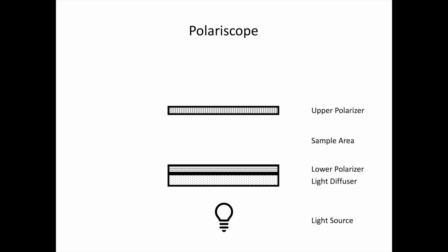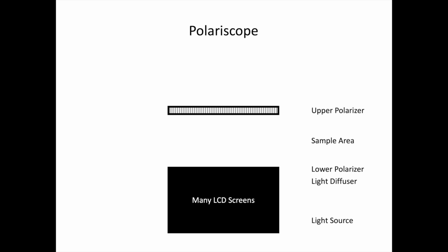My polariscope that I'm using in these videos simply consists of an LCD screen, in my case an old iPad, and an upper polarizer, which is just a linear polarizer I've oriented appropriately. So let's take a look at my polariscope. Here you can see this screen. This is just the screen of an old iPad. And so the light we're seeing is actually currently plane polarized. And it's plane polarized in this instance in a north-south direction. So this is one of the two most important viewing configurations we'll have for our polariscope, and with it we'll be able to transmit plane polarized light through our minerals.